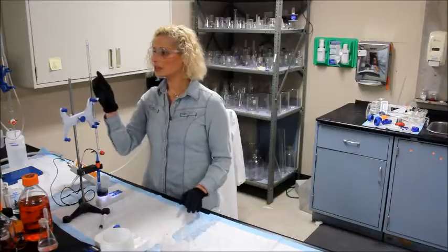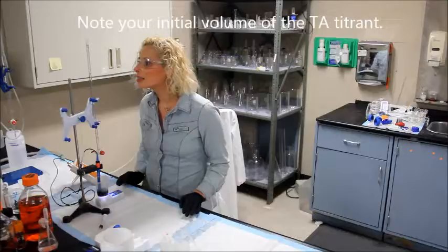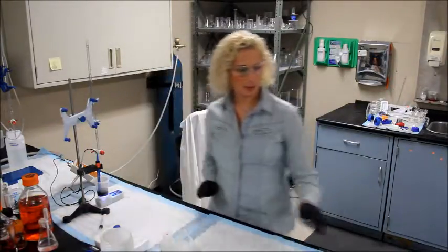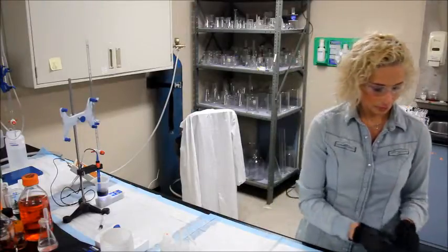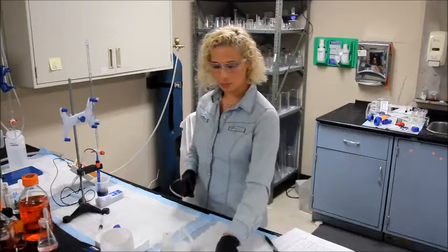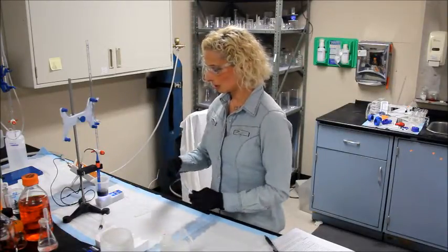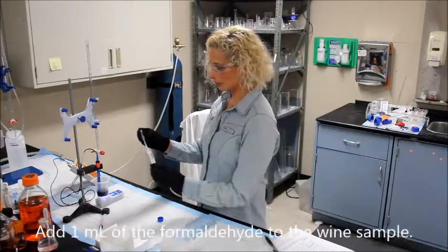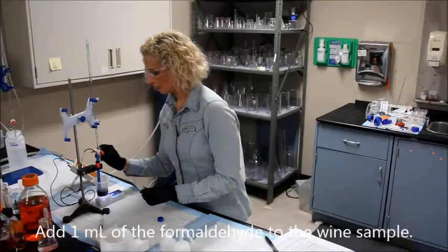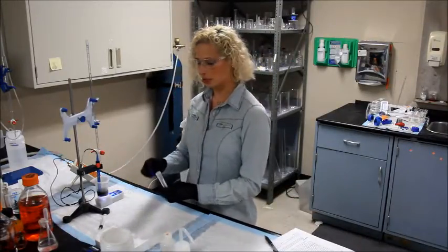You do want to note your initial volume here — I'm sitting right at 2 mls, I'm going to write that down. Now you're going to add 1 ml of your pH-adjusted formaldehyde using a transfer pipette. Add it to the wine mixture. This should drop the pH immediately.